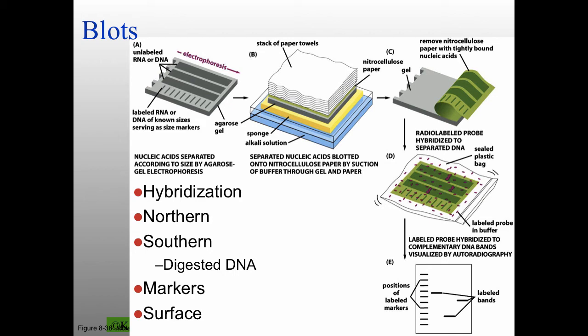And then you mix together this blot with your probe and then detect that probe somehow, with antibodies if we're talking about the non-radioactive, or with X-ray film if we're talking about radioactivity. This process is hybridization. Again, it's your probe together with all of these different DNAs. You're trying to identify the ones which match whatever your probe is.